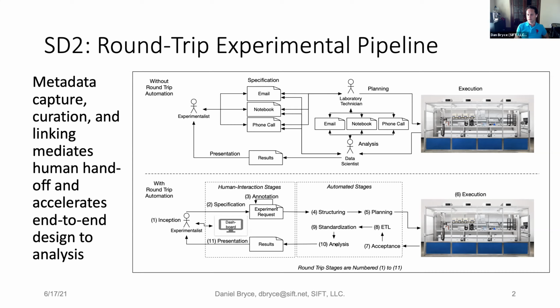And we have different ways of presenting that information to them, either through developing custom notebooks where you can plot the data however you want, or we also have a tool called Escalation that'll allow you to look at reports similar to what you might have seen in the previous talk. And across all of this, we also have a dashboard for the experimentalists. They can track the progress of their experiments, because these things do take a number of days to run, and there's also several processing steps involved, so they can keep tabs on everything that's happening.